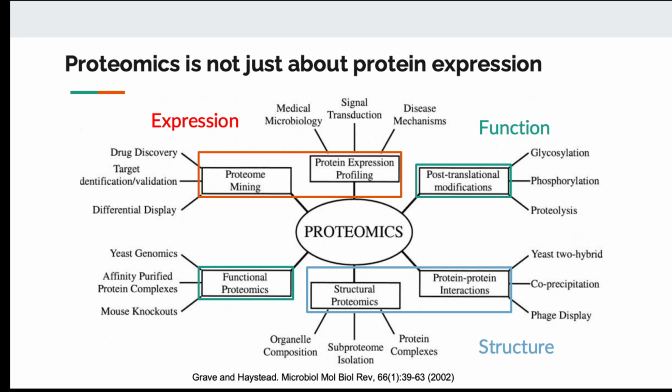So first, just want to make sure that we know that proteomics is not just about protein expression. It's a study of protein. So protein has function, it has post-translational modification that can affect how it operates in the cells. Right? It has 3D structure, so two proteins can bind together. Those are also important to understand the protein. But most of the time, when we talk about proteomics, usually it's about measuring the expression level of proteins. So it's similar to transcriptomics, but at protein level.